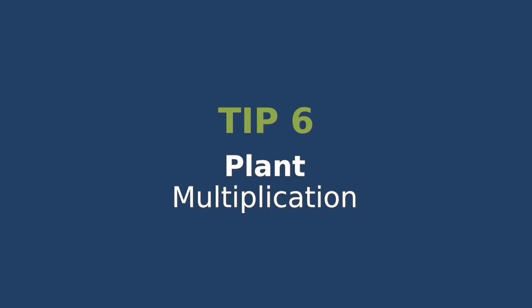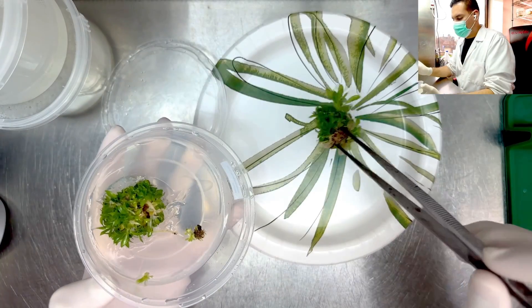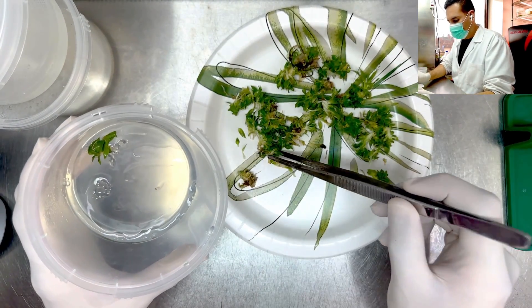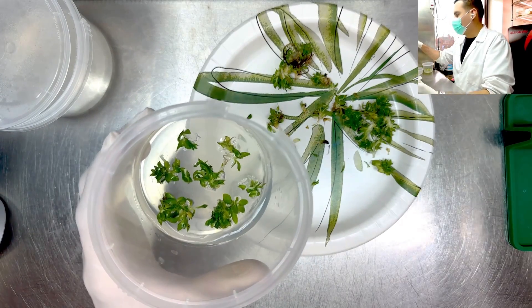Plant multiplication and subculturing. Plant multiplication is the main goal of tissue culture. After a few weeks of initiating your plants in tissue culture, they will multiply. You can take those new plants and place them into new vessels with fresh media. These plants will keep multiplying and you can repeat this process many times until you have hundreds of thousands of plants.